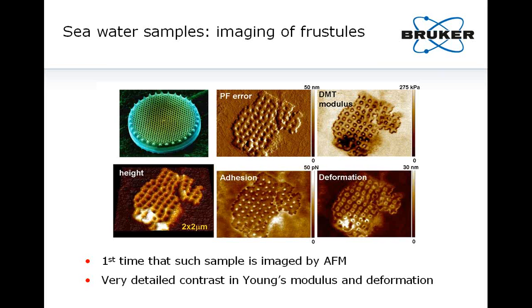So what we call a frustule is the porous cell wall, or the external layer, of diatoms. The frustule is composed mainly of silica, and it's coated with a layer of organic substance called pectin. And this is a fiber which is most commonly found in cell walls of plants, and it also contains several types of polysaccharides.